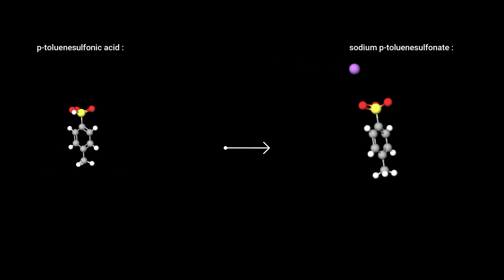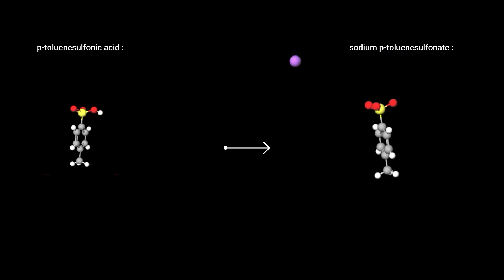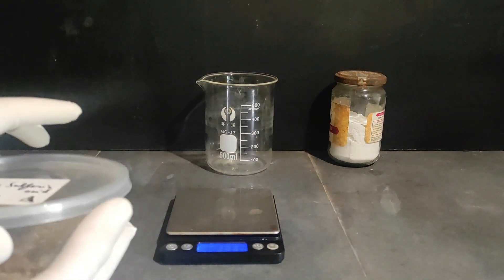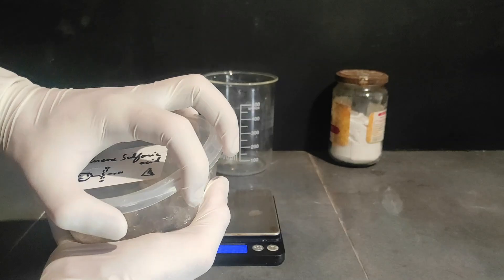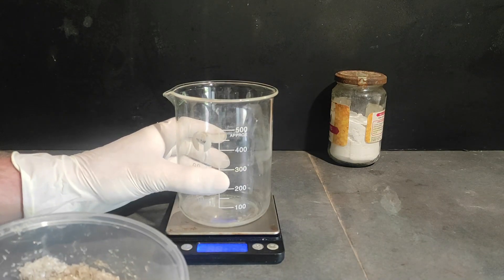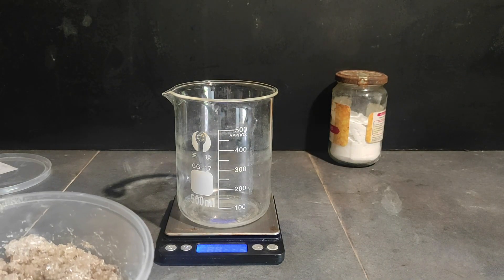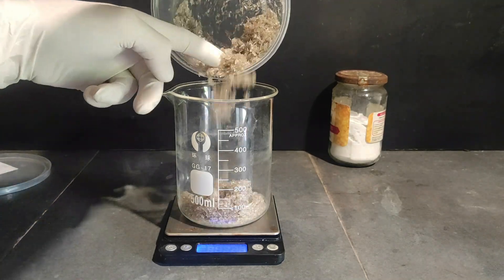Let's start with the first step. To make the para-cresol, we first need to neutralize our para-toluenesulfonic acid to transform it into its sodium salt. I will use sodium carbonate because you can see the reaction happening clearly with the evolution of CO2 gas. You could also use other bases like sodium hydroxide or bicarbonate, as long as you use the correct amount. I first weighed the crude para-toluenesulfonic acid we made in the last video — it came to be 70g, though in reality it's less because it's still a little wet probably.